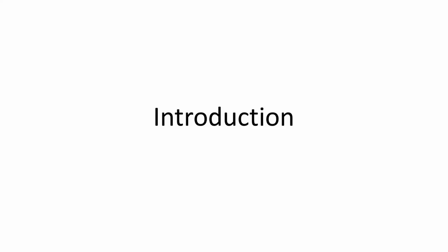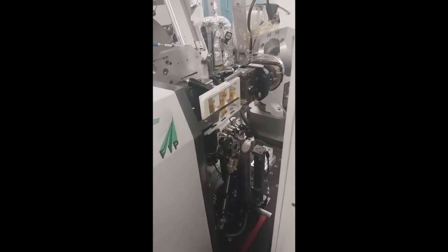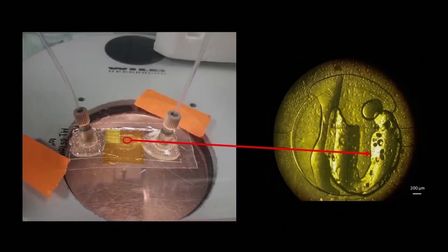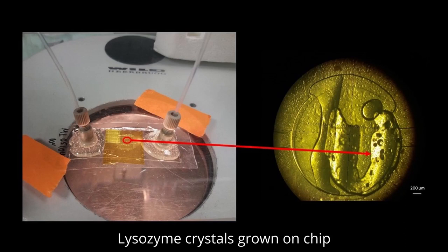One of the main advantages of these microchips is the choice of fabrication materials rendering the chips compatible for in-situ X-ray diffraction data collection at room temperature. The on-chip crystallization experiments require small volumes of the protein sample, reducing the overall cost of working with these high-valued biomolecules.